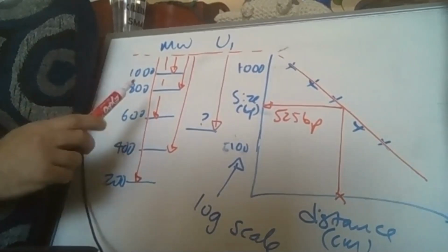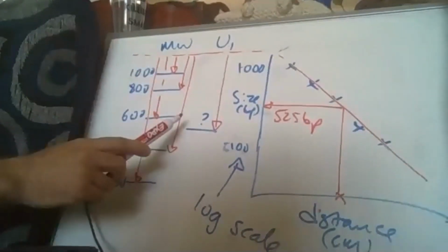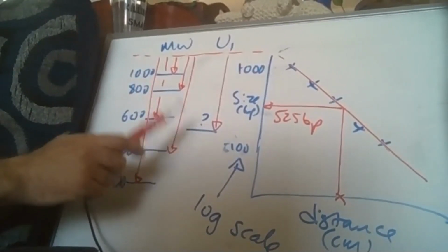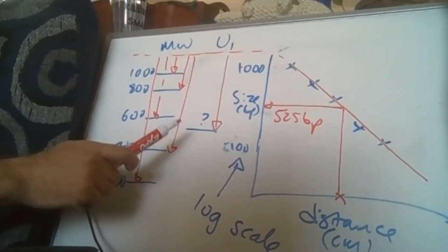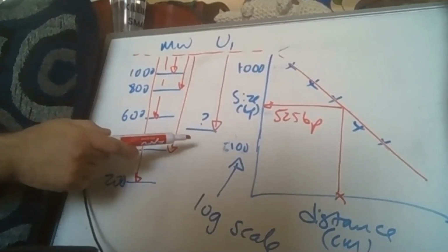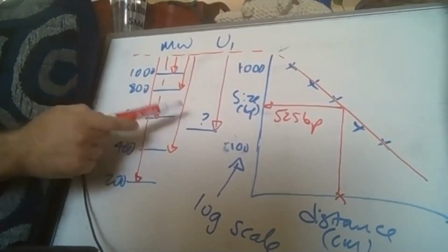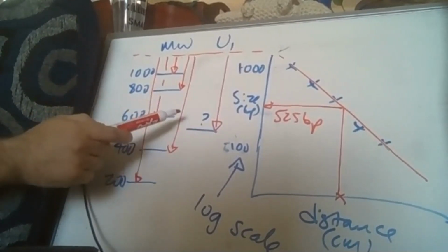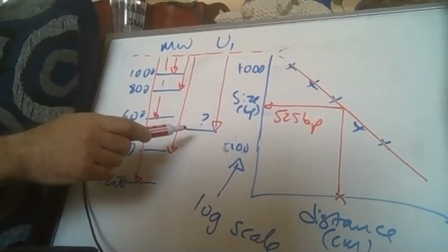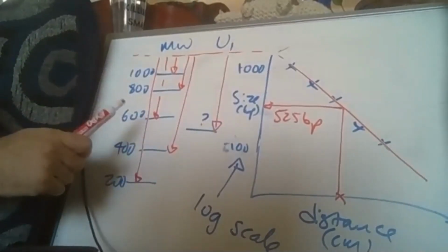Depending on which unknown you're looking at, there's different bands, right? I think unknown 1 has 1 band, unknown 2 has 2 bands, and unknown 3 has 3 bands. And so you need to do this for each band. Sorry, noise from the kitchen. Each band of the unknown. So for unknown 1, you're going to give me 1 value, both in distance and the estimated size. For unknown 2, you're going to need to do this for the 2 different bands.